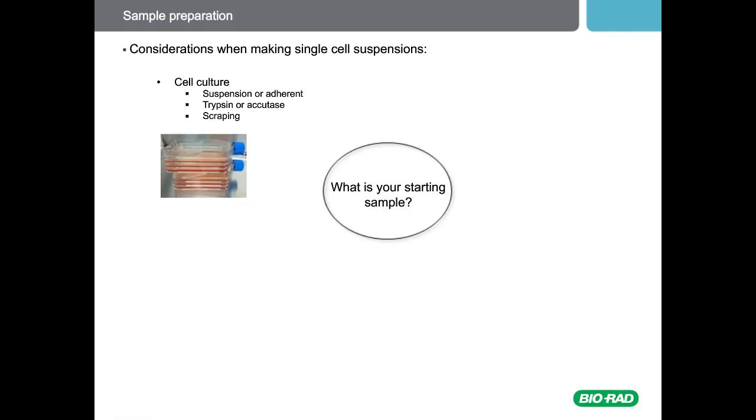In order to make a single-cell suspension from bone marrow, the bones need to be harvested with as little muscle attached as possible. The ends are removed and the bone marrow core can be flushed out with PBS or media using a needle and syringe. The optimal size of needle will vary depending on the species and age of the animal. The bone marrow plug can then be disaggregated into a single-cell suspension by passing through a fine gauge needle followed by being passed through a filter, and this will ensure there is no contamination such as muscle or pieces of bone. After disaggregation, the cells can be washed in PBS and resuspended at the right concentration.